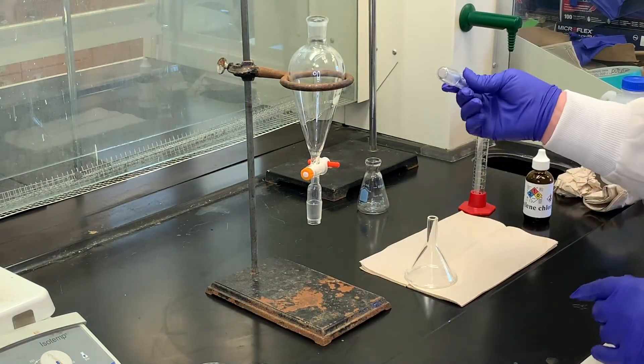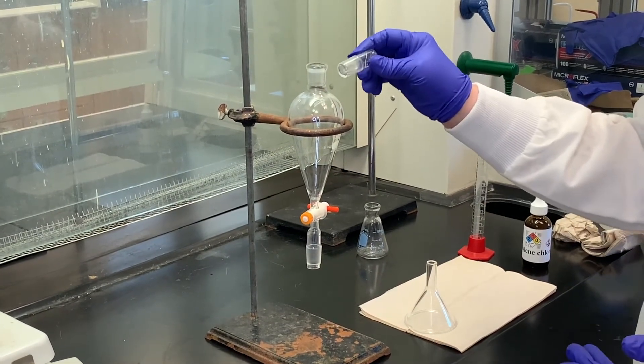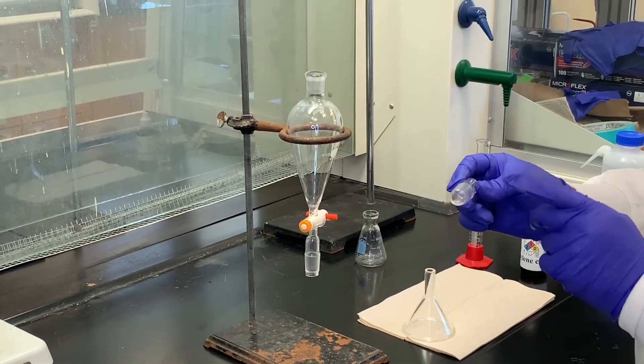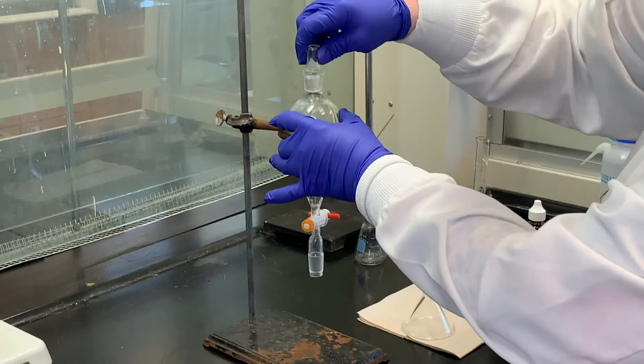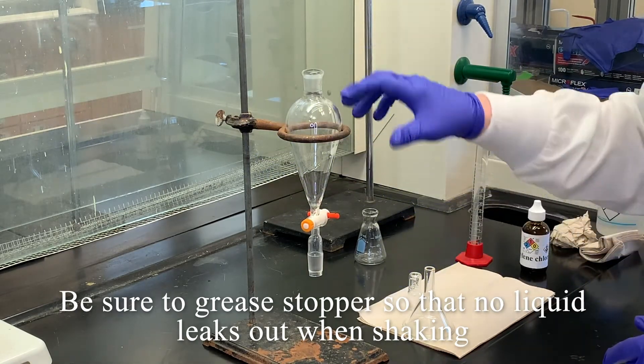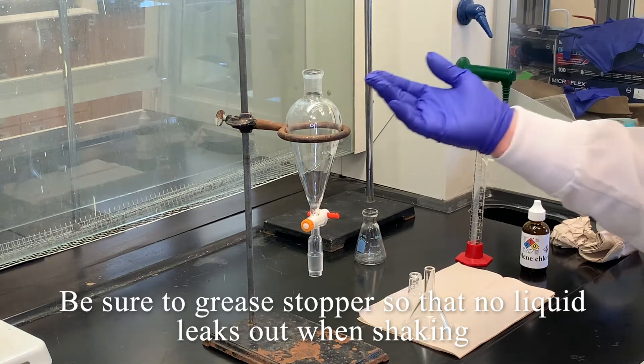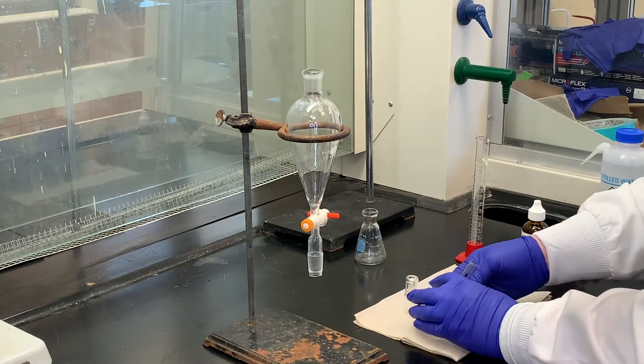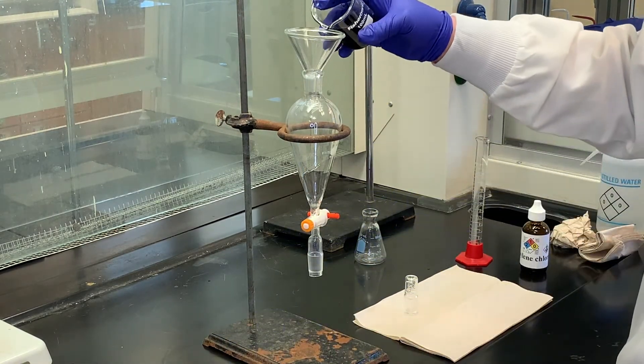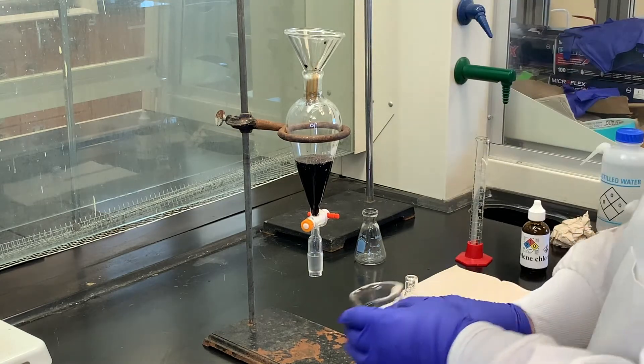The other thing about this separatory funnel is that it comes with a glass stopper. These are what they call glass joints. Anytime you use this piece of equipment, you want to make sure that you grease the stopper. When you put it in, you want to make sure you always rotate it to ensure everything is greased. The reason is, we're going to turn this separatory funnel upside down, and if there's not enough grease, you can lose some of your solution through the stopper itself. Always use a funnel. I'm going to add the solution, this mixture that has cooled down.